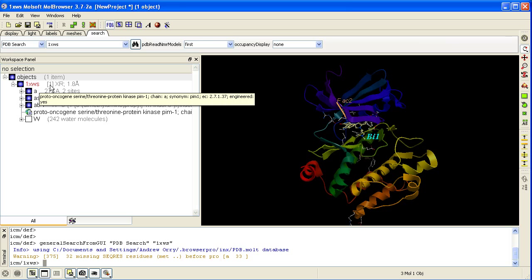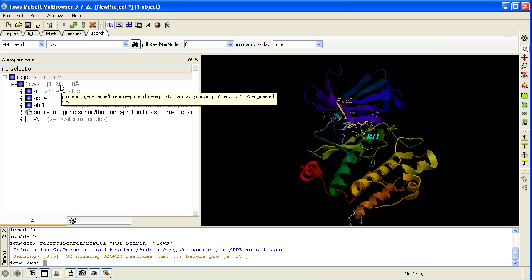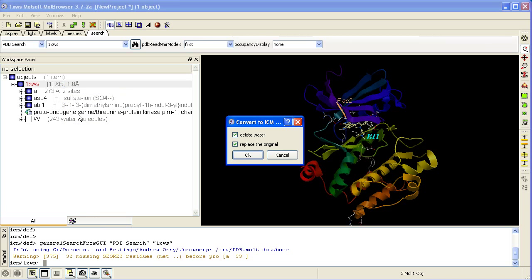For some functions such as displaying the ligand binding pocket surface colored by properties, or for displaying hydrogen bonds, you need to convert the X-ray structure into an ICM object. To do this, right click here and select Convert PDB. Select Delete Water and replace the original. Click OK.